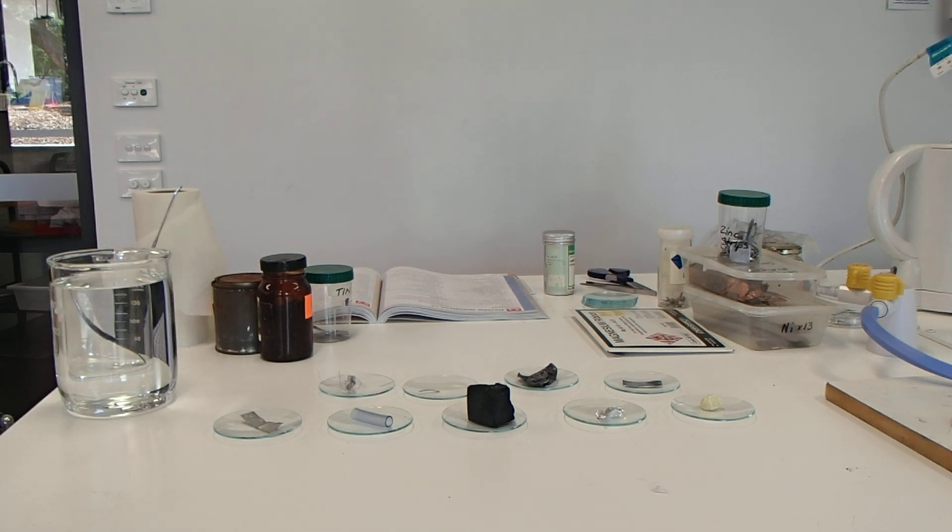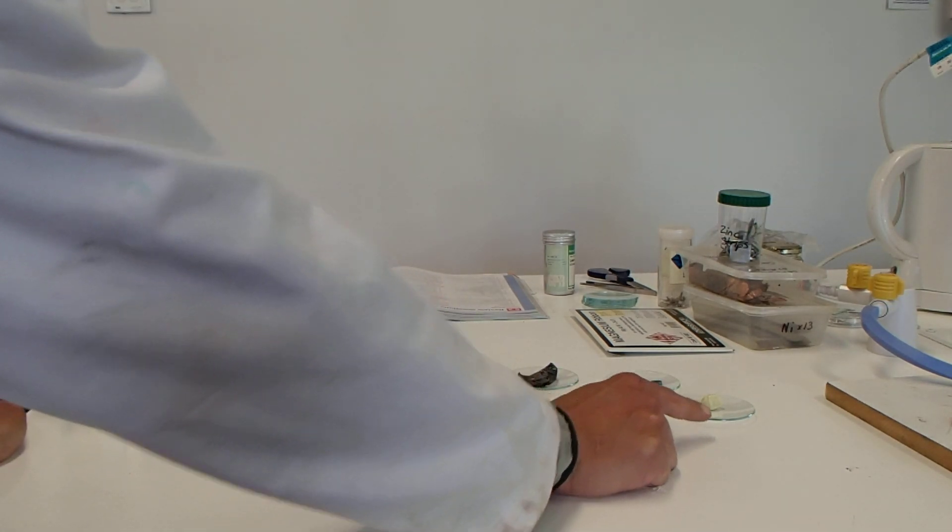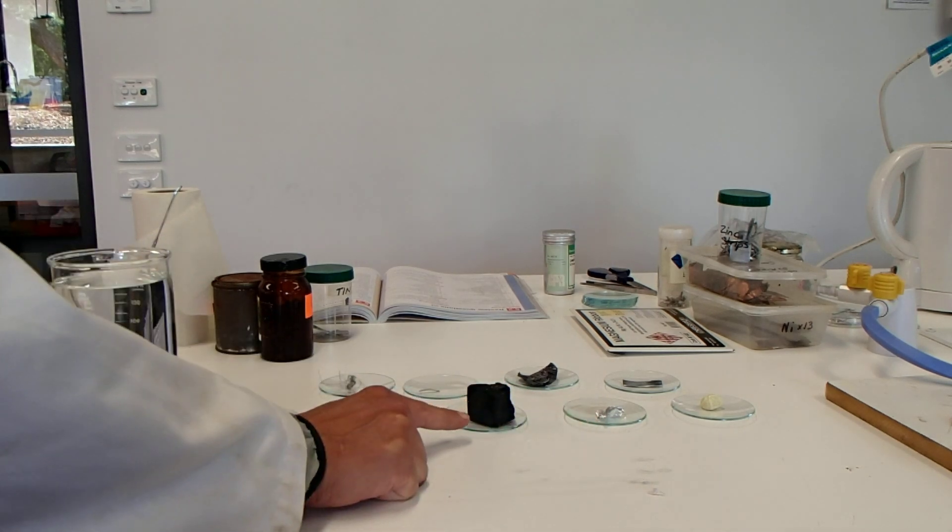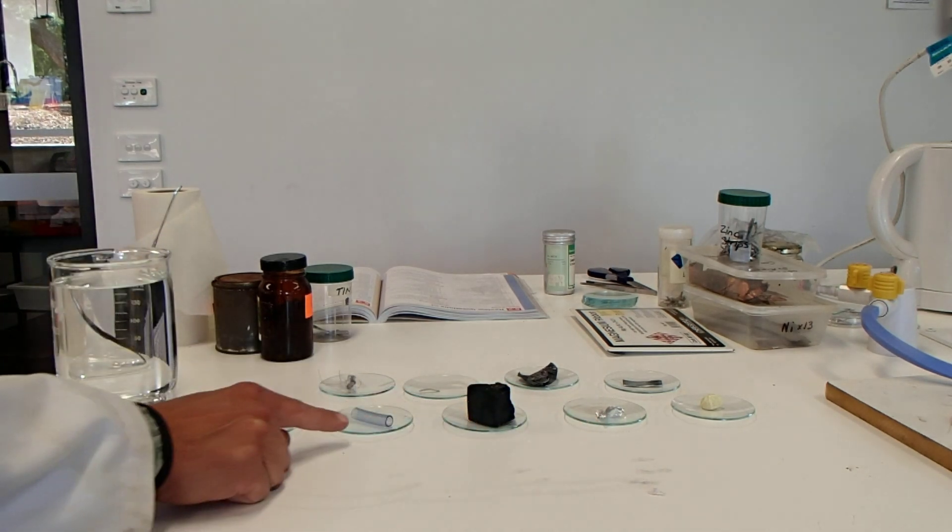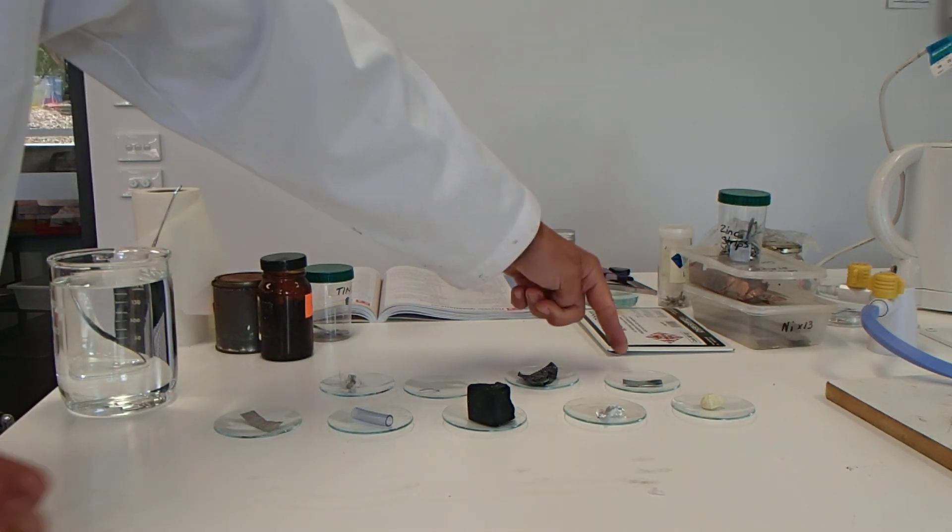I'll just show you the samples we've got today. We've got sulfur, aluminum, carbon, silicon in the form of some tubing, tin, zinc, some lead, magnesium, and iron.